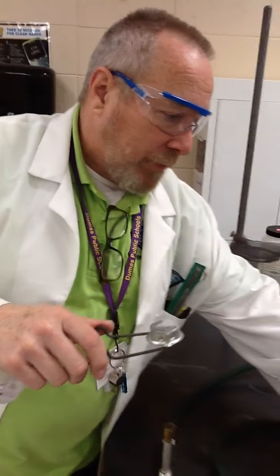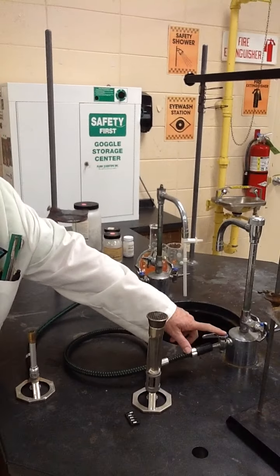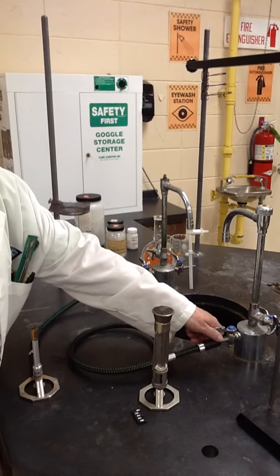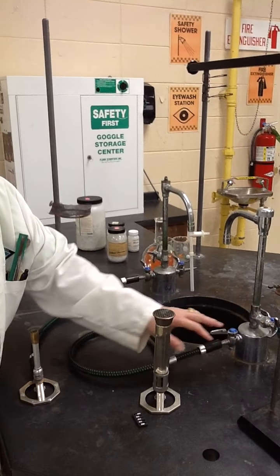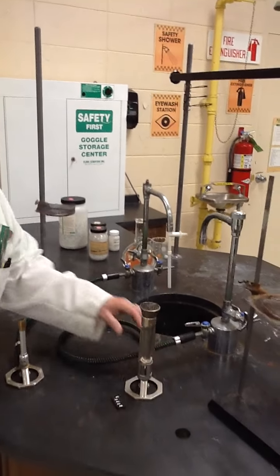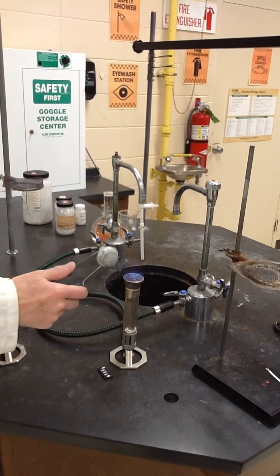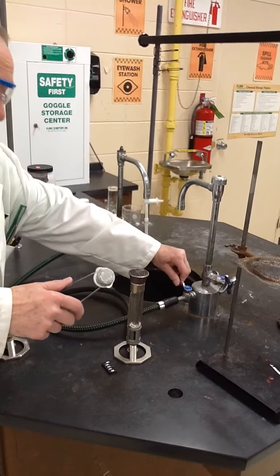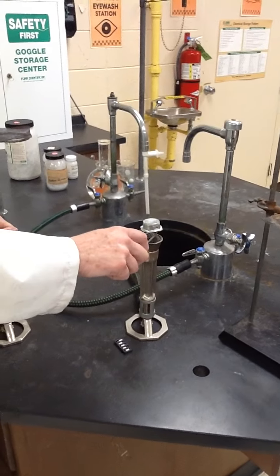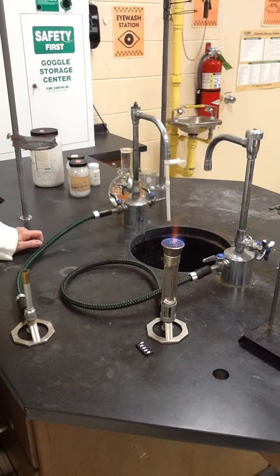So to light the Fisher burner, you turn the petcock all the way on. Don't try to adjust your gas flow here. These don't give good control of the gas flow. We will use the valve at the bottom of the burner to adjust the gas flow. You hold the striker over, you turn it on here, we will hold the striker over the burner, capture some gas in the bell, and light it.